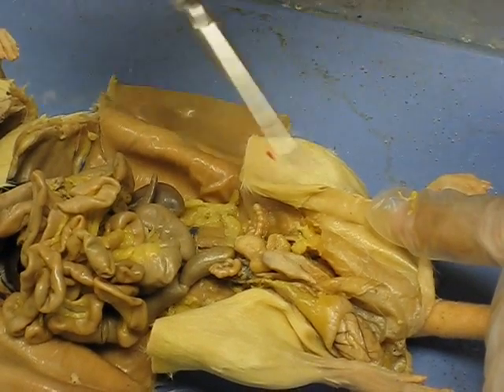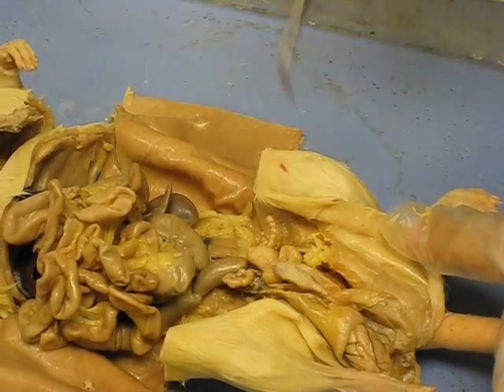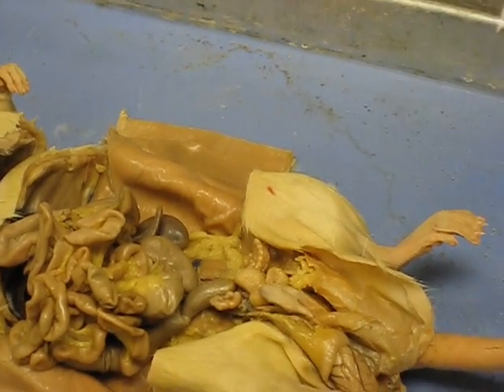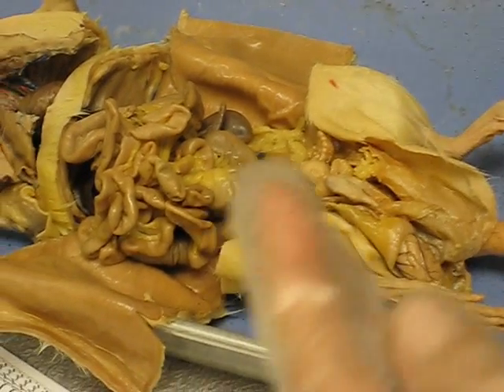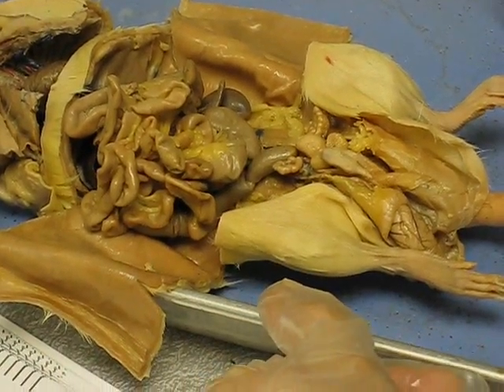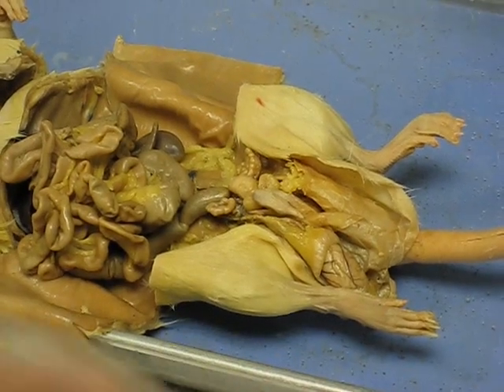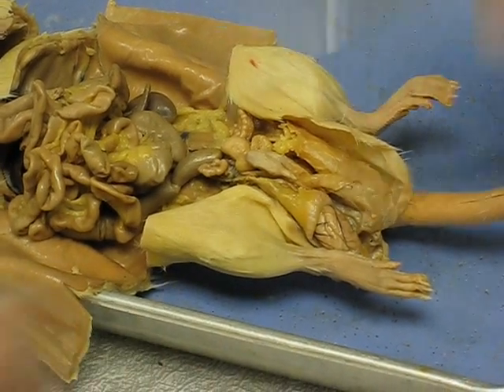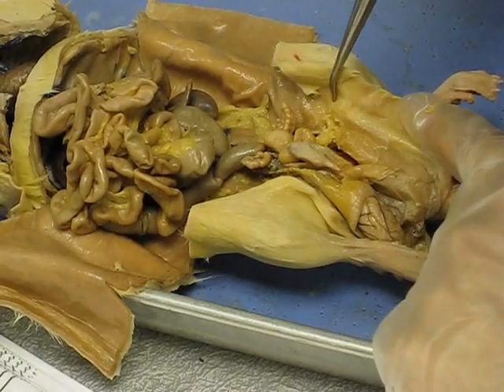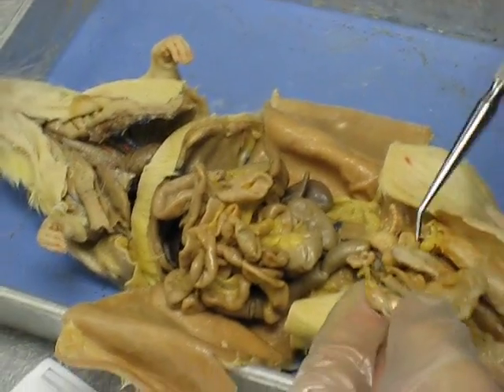So if there's something on the practical that says name the area surrounded by the cremasteric pouch, the answer is the vaginal cavity. Why it's called that in a male, I don't know. The inguinal canal is the opening right in here where everything first enters. Inside, the cavity surrounded by the cremasteric pouch is the vaginal cavity — even in males. Females have a vagina, but this vaginal cavity terminology applies only to the male.